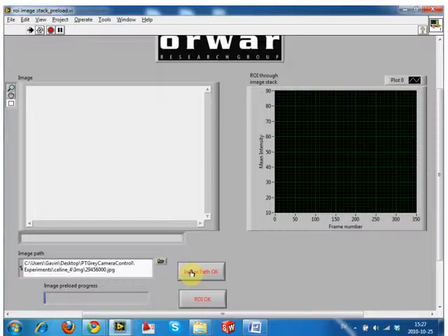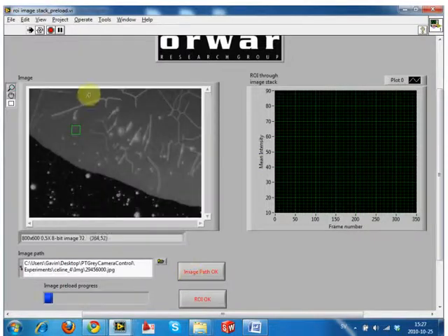So if I hit OK now, I have this, but if you look down here, it's running things in the background. So I can move this guy around and choose things that I want to look at. I may want to look over here, but all the time it's running things in the memory. Because it's running two things simultaneously, I need to make sure it's right, else you're going to load a lot of things to the memory that you don't want to be there.